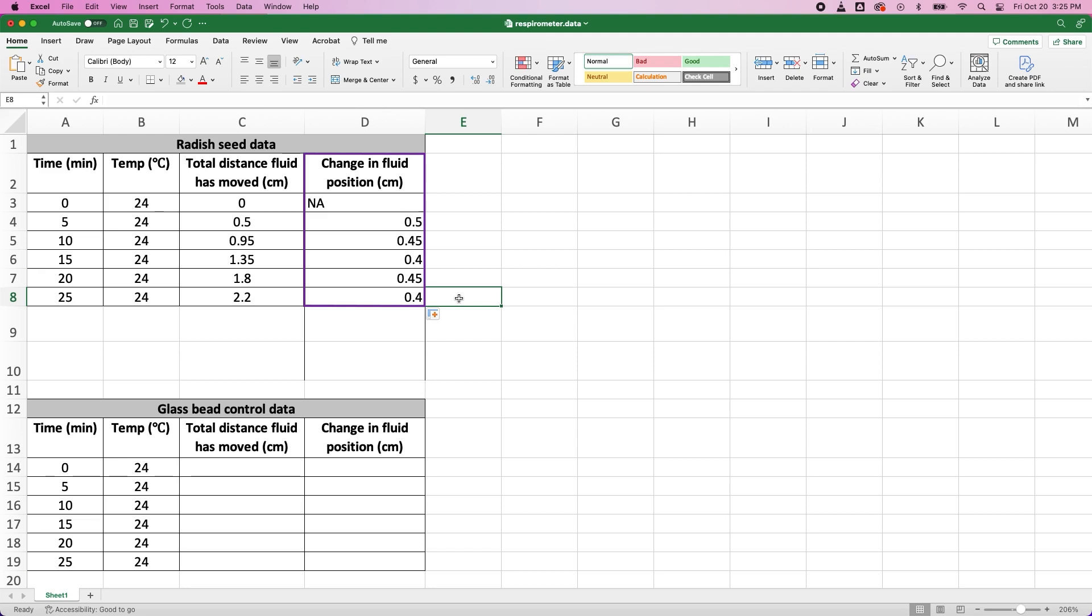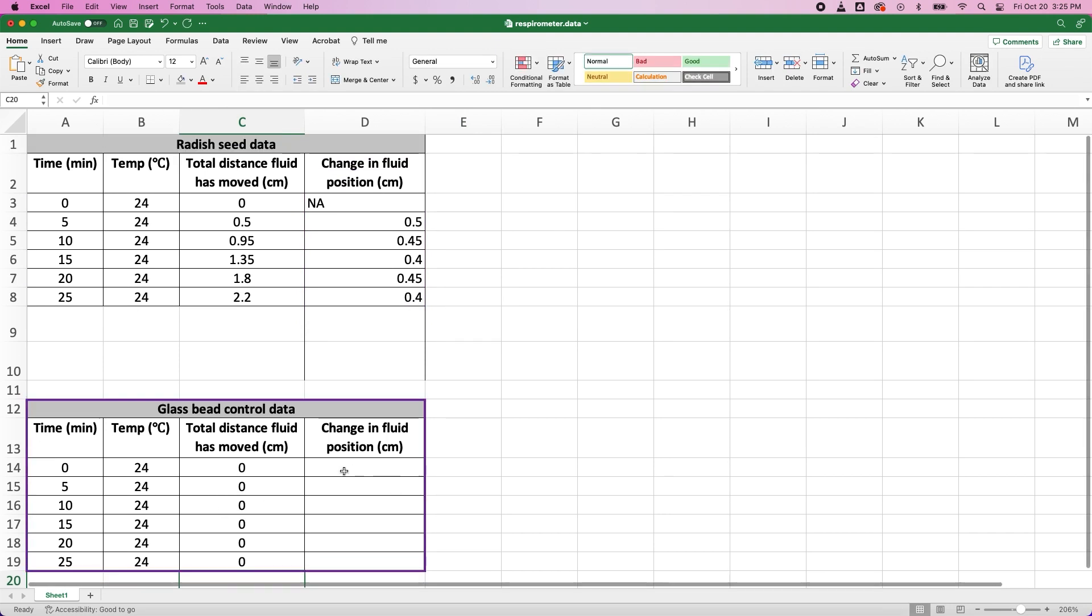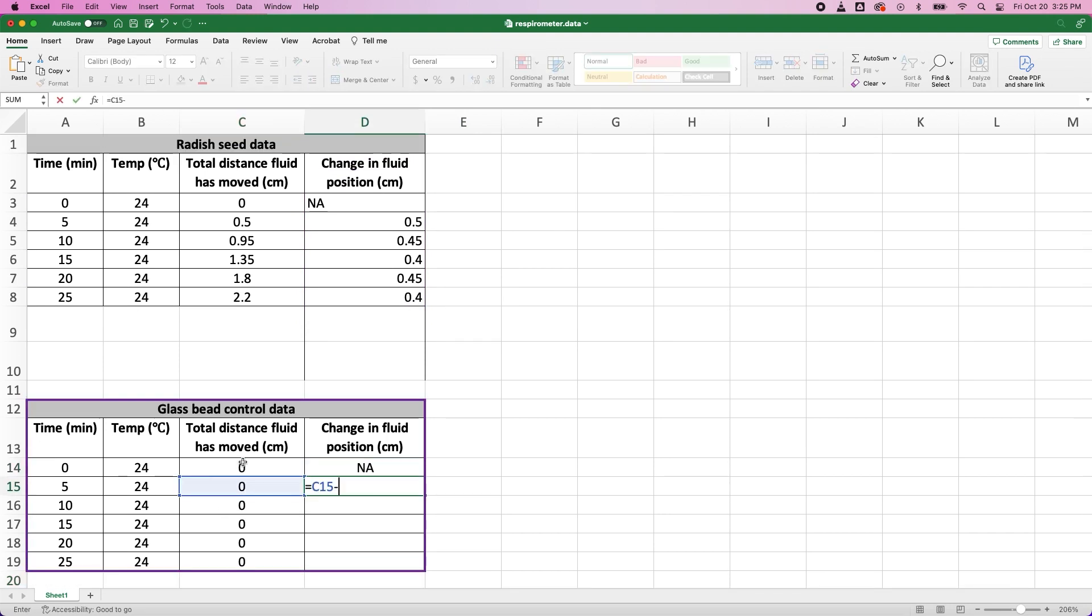If there were any changes in temperature or pressure during the experiment, they would have affected the position of the fluid in the control respirometer. From my control data, I can see that the position remains steady in the control, so I'm all good.